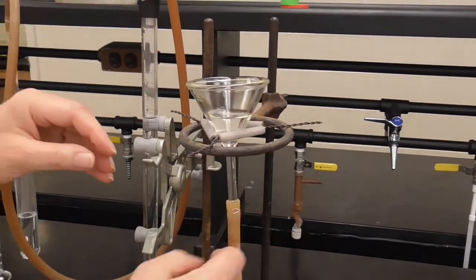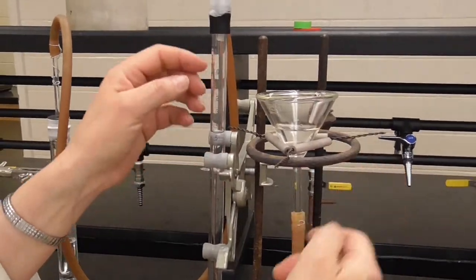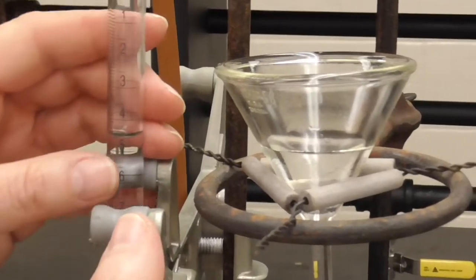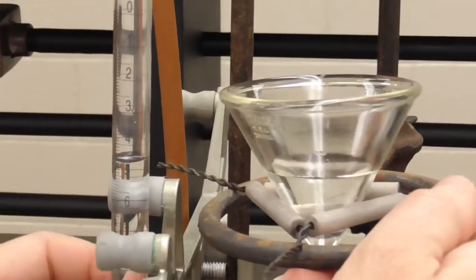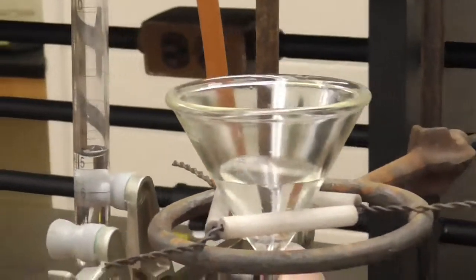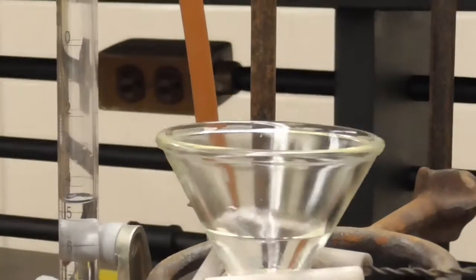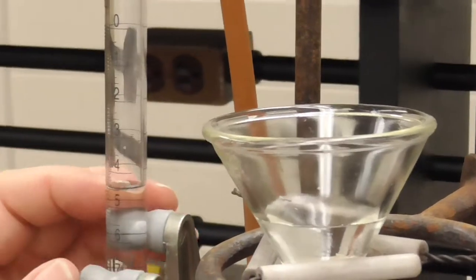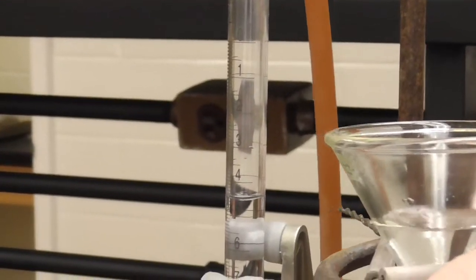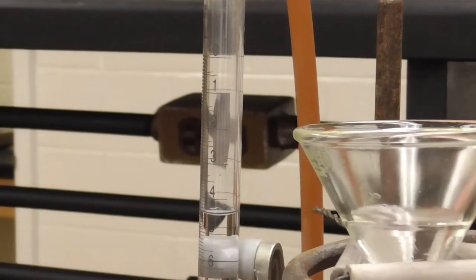Now for the little more challenging part, and that is to get the level in the burette to be level with the funnel. For that, I have to use my best judgment about how level these are, and it looks like I may be fairly close. I'm going to try to raise the funnel just a little bit.